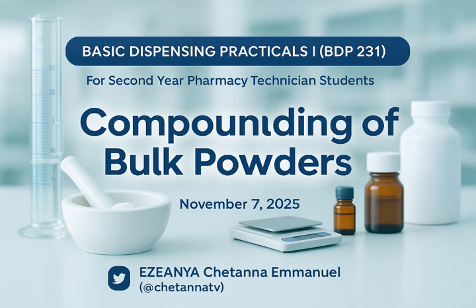Please, while writing your method, don't say I added, we added. No. Don't use first person, I did. Simply say this was added, was weighed, was measured. Don't say I did, we did. Say 20 gram of zinc oxide was weighed and added. That's how I want you to present your method. Is that clear? Yes. Good.